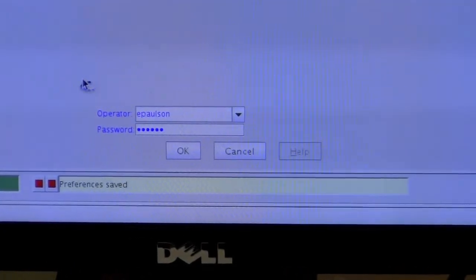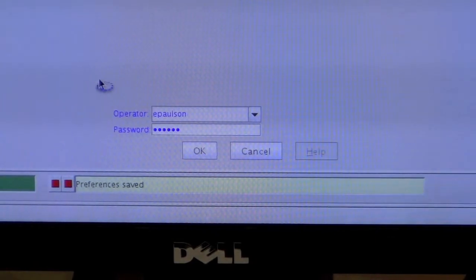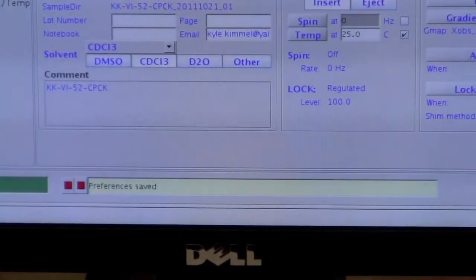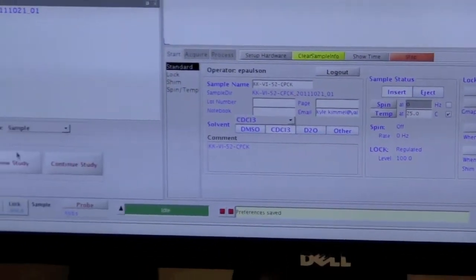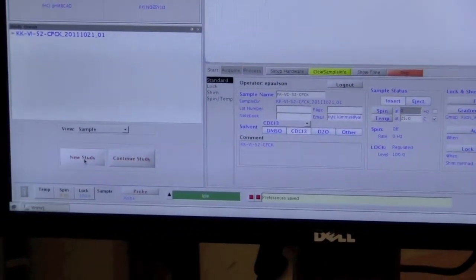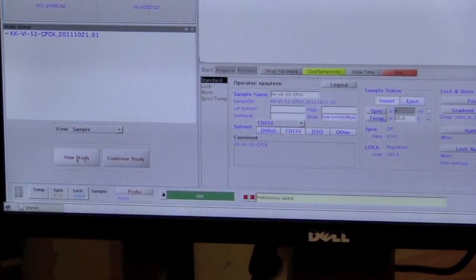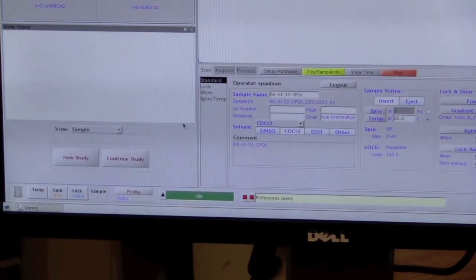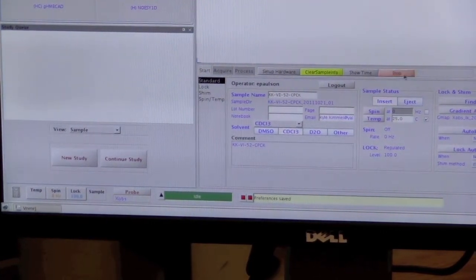After you log in, the first thing you want to do is create a new study. Click on this button here to start a new study. Now it may take a while to update while it's making a new study.